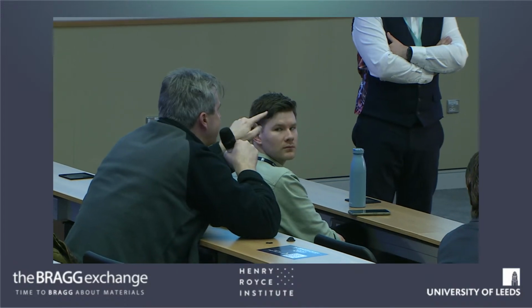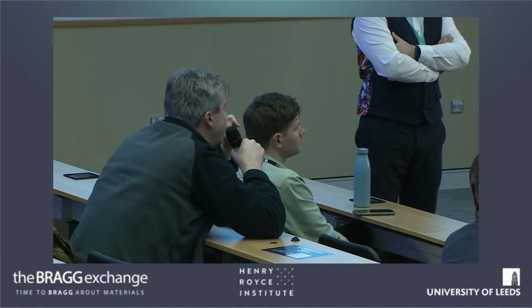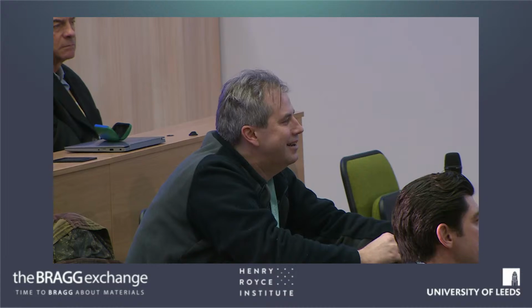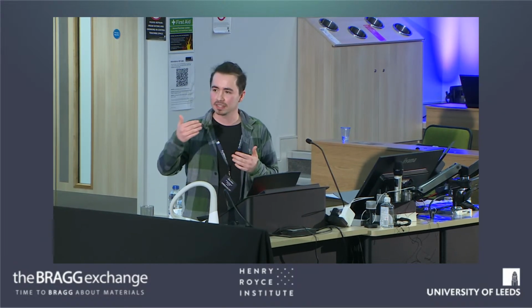And there were a few points where you said it was important to go back and scan the same area many times. How do you always guarantee it is the same area? So we have a script that we built that uses, again, cross-correlation to measure the drift between two images, and then it will compensate for that by moving the piezos back to that area and countering that in the controller as well. So, calculating the drift over that time and stuff like that. Thanks, that's great.